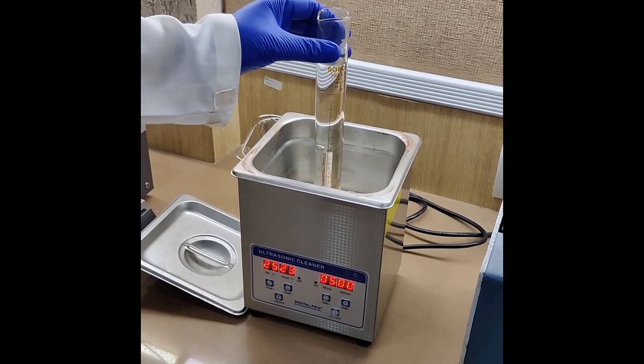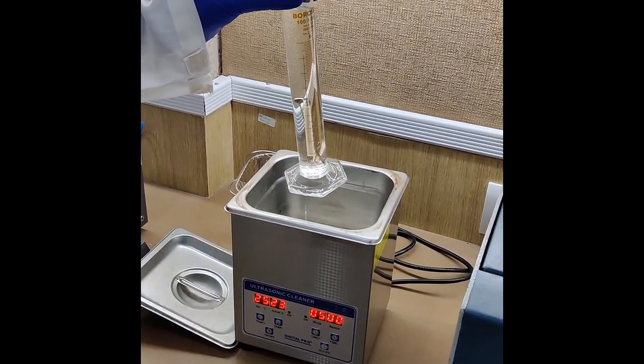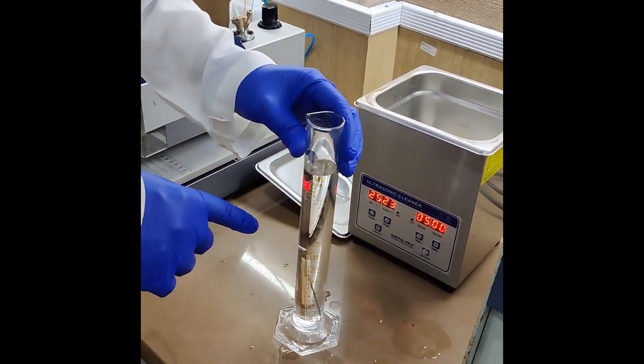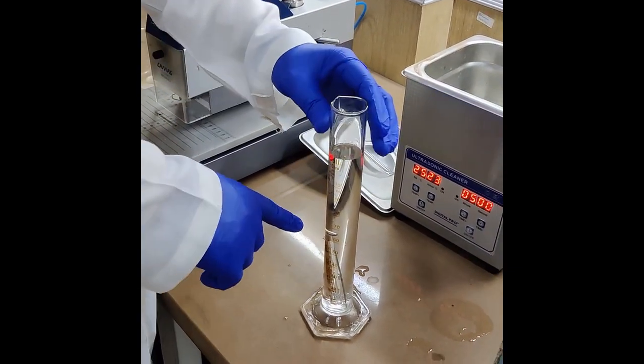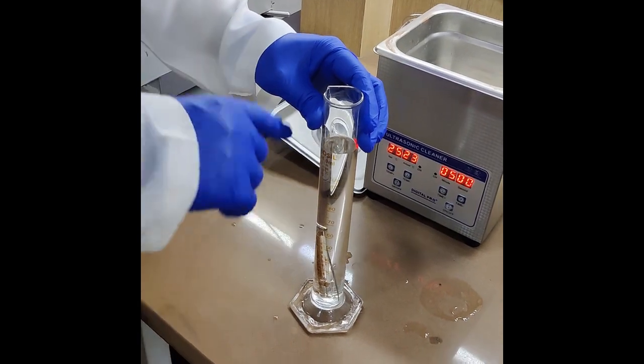Once the sonication is done, remove the measuring cylinder along with the syringe outside and remove the syringe from the measuring cylinder along with the piston.